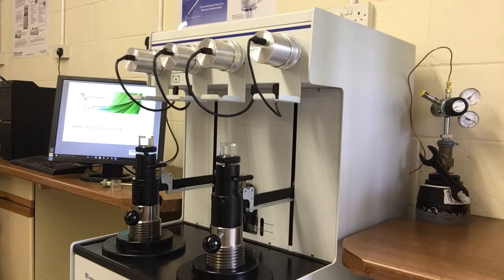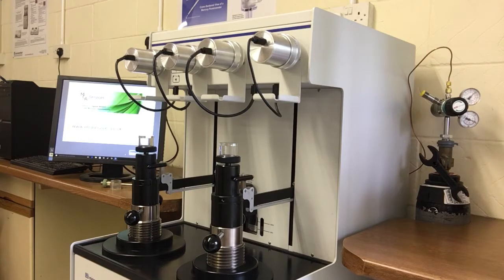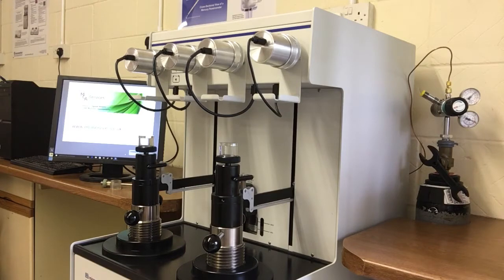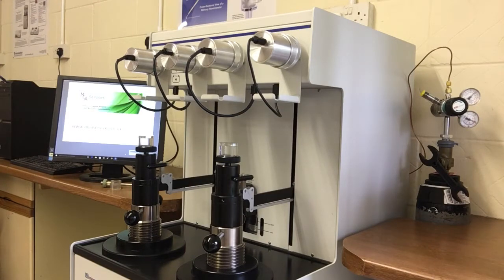The ending pressure of the low pressure analysis is very much dependent on the sample: its morphology, whether it's a powder, whether it's granular or whether it's larger solid pieces, and also whether we expect to see any porosity within that region.